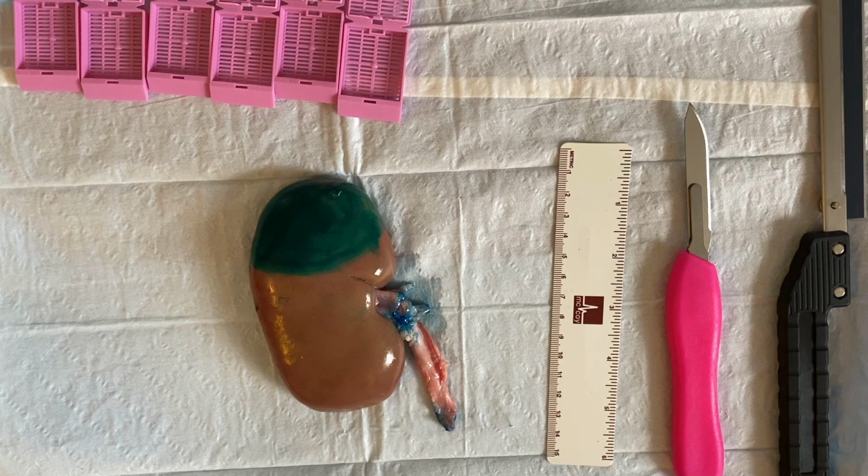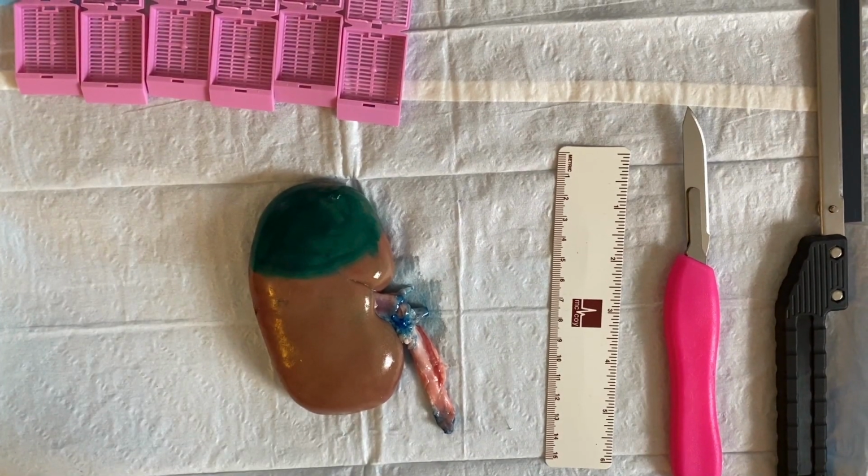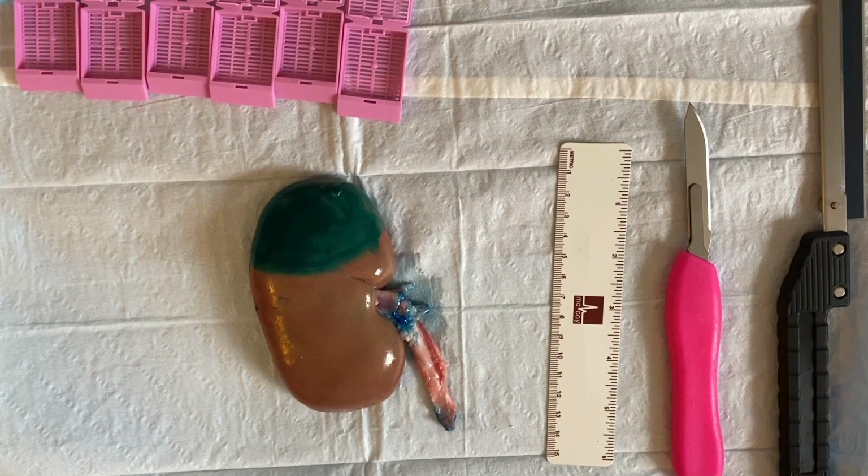So what I've done is I've created an inked area in the superior aspect to demonstrate where I would have quote-unquote palpated the lesion. Remember to examine the renal artery, renal vein, and ureter for presence of tumor before you shave these structures.